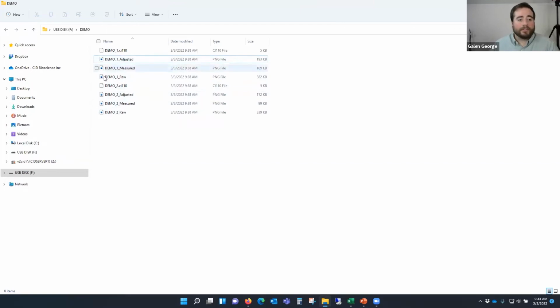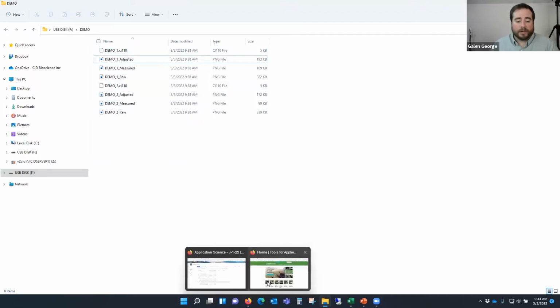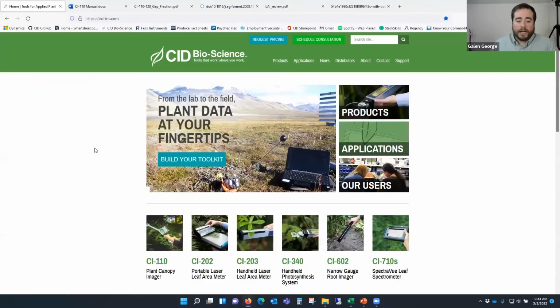Now, that's how the data is accessed, and it's really simple and straightforward. There's no extra steps really needed. But I do want to show you guys, for general troubleshooting and for further information for yourselves, how to access resources through our website, essentially.